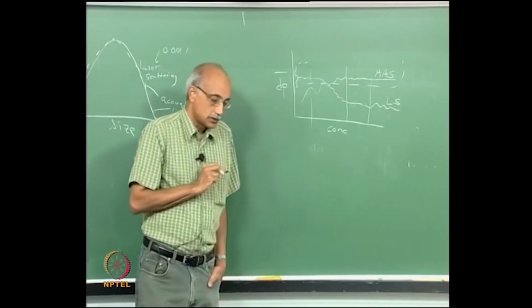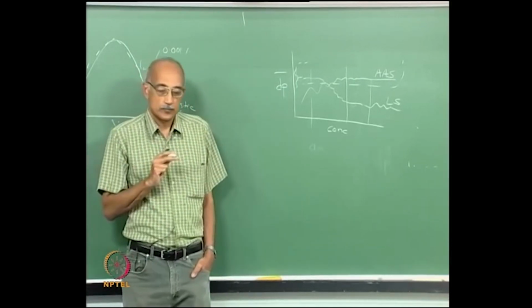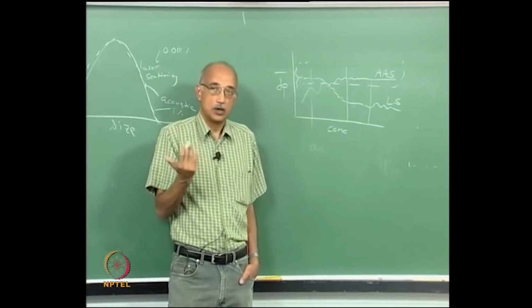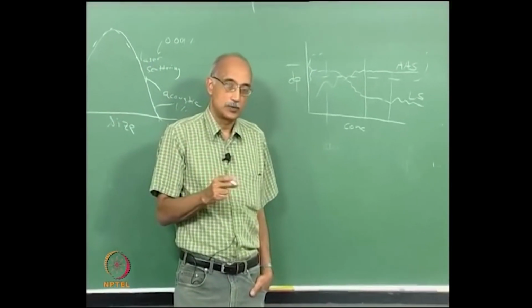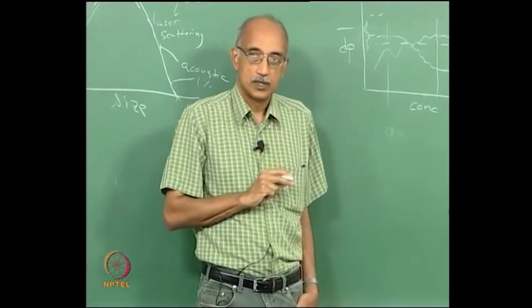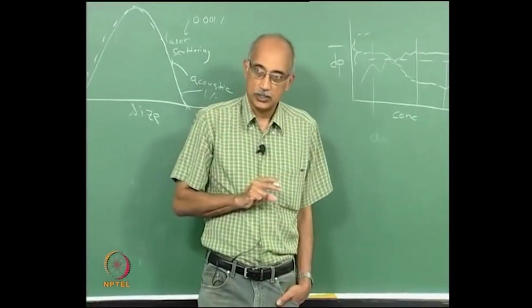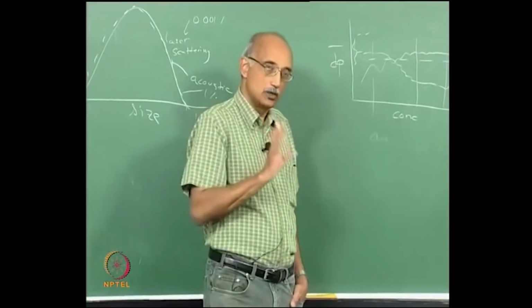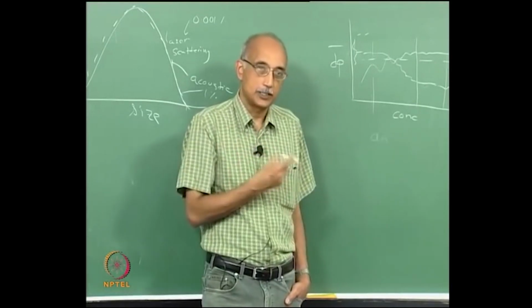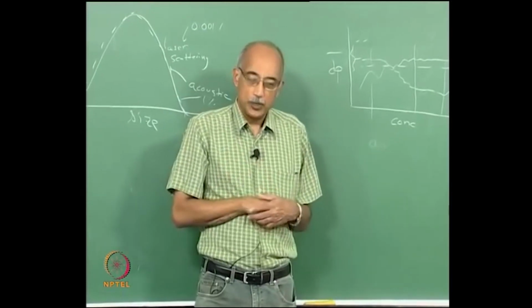I mentioned that the acoustic size analyzer could be used for emulsions, and in fact some very careful quantitative correlation work has been performed using SEM-TEM image analysis and particle size measurement using acoustic attenuation, and you can see a virtual one-to-one correspondence between the particle size distributions that are predicted by the two methods. So it is a very powerful method.